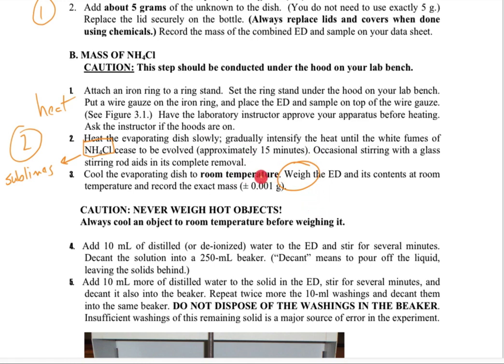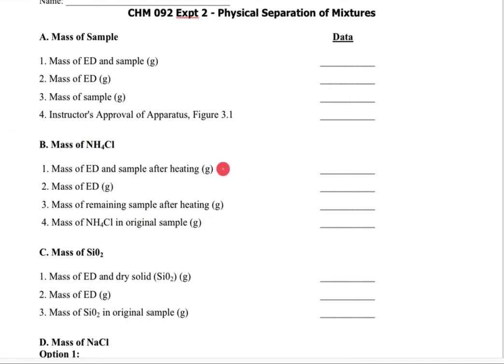Let's just talk about the data right now, about what's happening here. So, like the raw data that you're going to be collecting in the lab or in the video. First off, you'll see the mass measurement for the evaporating dish. You'll also see the mass measurement for the evaporating dish plus the sample. Remember the sample is this mixture that I mentioned just a few minutes ago.